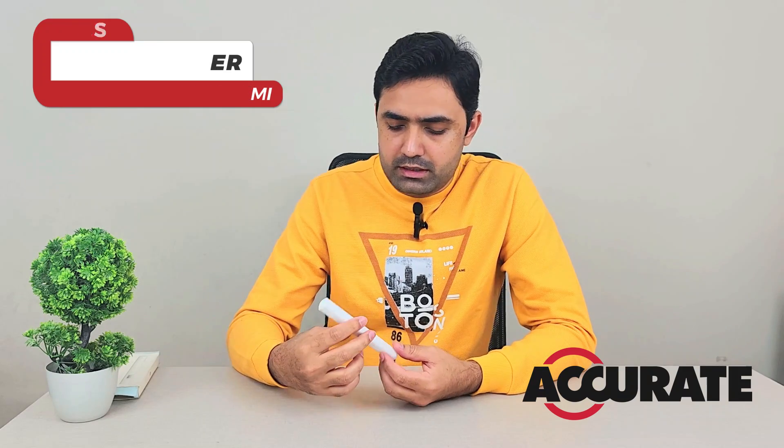Due to the low quality of water and the pollution — especially solid materials — you can use this kind of TDS tester to detect solid particles inside the water and decide if it is pure enough. I use it especially when I travel somewhere and don't know the water quality. For a glass or two it's fine if you're just passing through, but if you're staying at a place for multiple days then you need something like this. It's made by Xiaomi and it's really high quality and accurate.